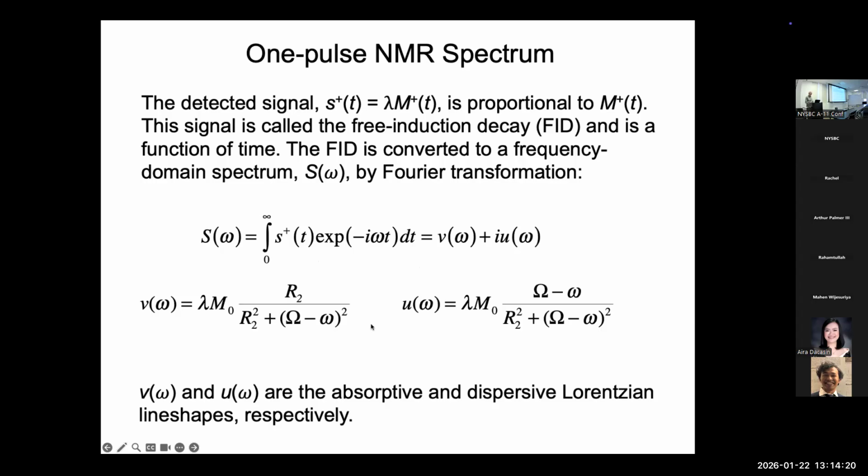And that's in theory. The data on the spectrometer is digitized. So you're actually doing a discrete Fourier transform, not an integral. And that turned out to have some important consequences, and we talk a little more about the actual data acquisition has some importance for how the experiment actually gets set up.